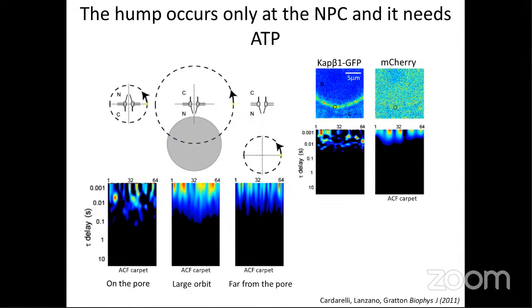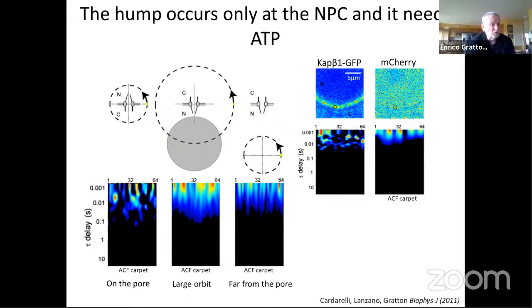Yeah, this works, for example, with the model that Liz Hine was using to see just the diffusion of a molecule within the nucleus, like a green fluorescent protein with different oligomerization and this kind of thing. But it doesn't need to be fixed on the nuclear pore, because she's looking everywhere. Exactly. But here, if you don't follow one nuclear pore complex, you cannot really say what is happening. Yep.